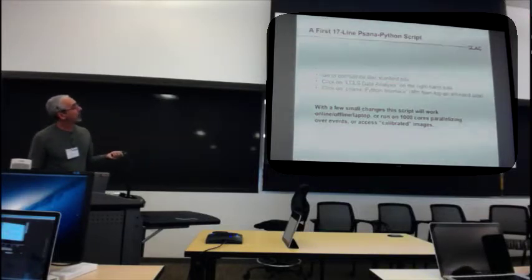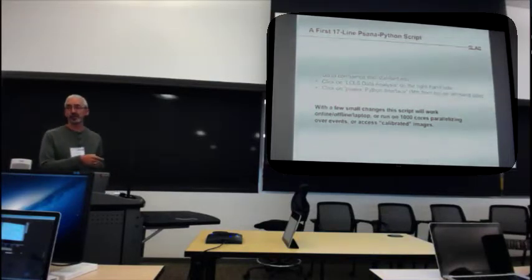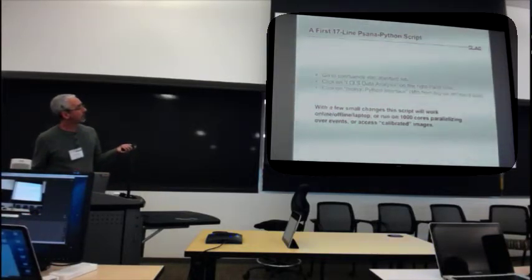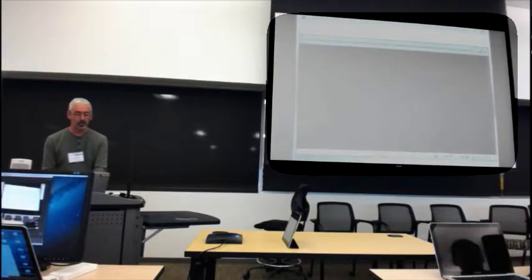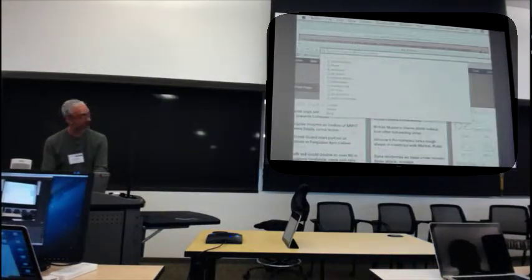All right, so now, if all goes well, you are going to run your first 17-line Psana Python script, which is going to access and plot the data. So we're going to go to Confluence, and I'm going to walk you through. We're going to go to confluence.slac.stanford.edu. Then log into the machine.